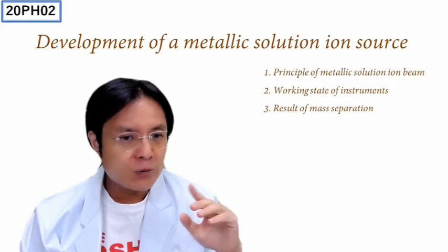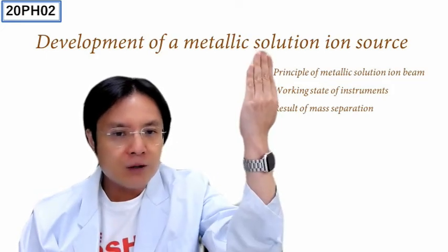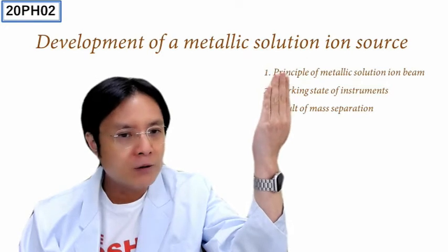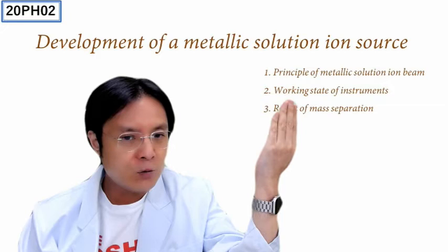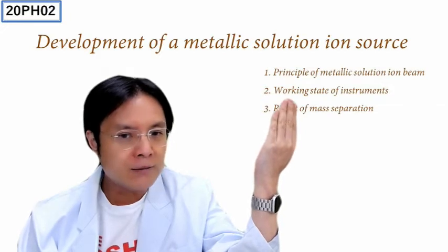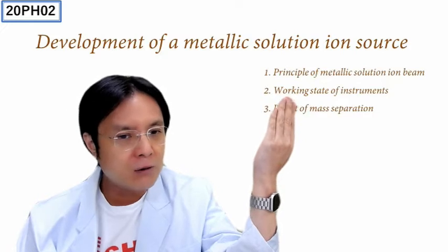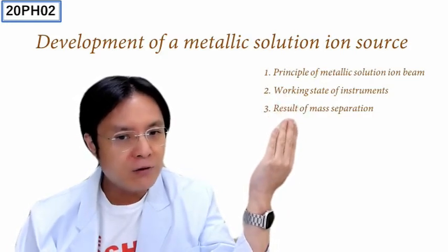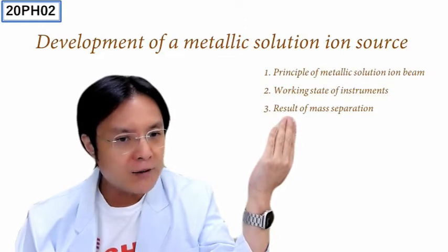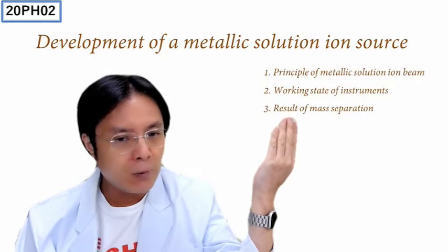In this YouTube session, I will firstly introduce the principle of this work. Second, I will show you the working instruments for separating the mass and also creating a focused metallic solution ion beam. And finally, I will show you the result of mass separation and its applications using this apparatus.